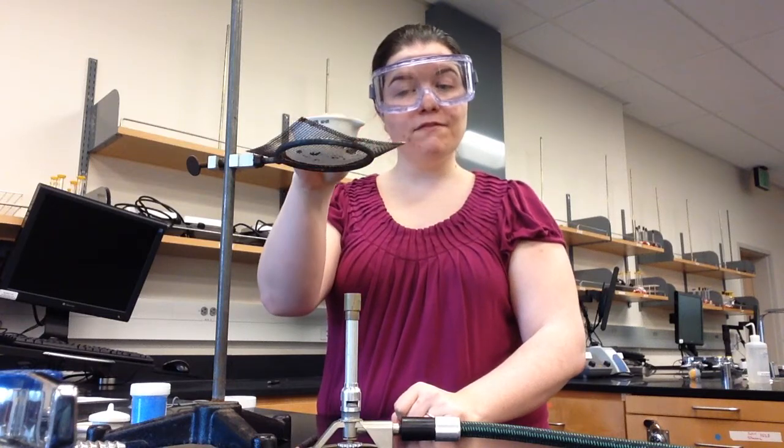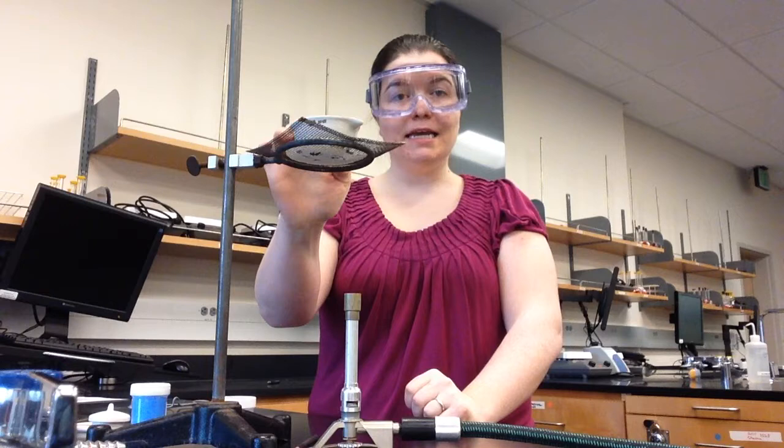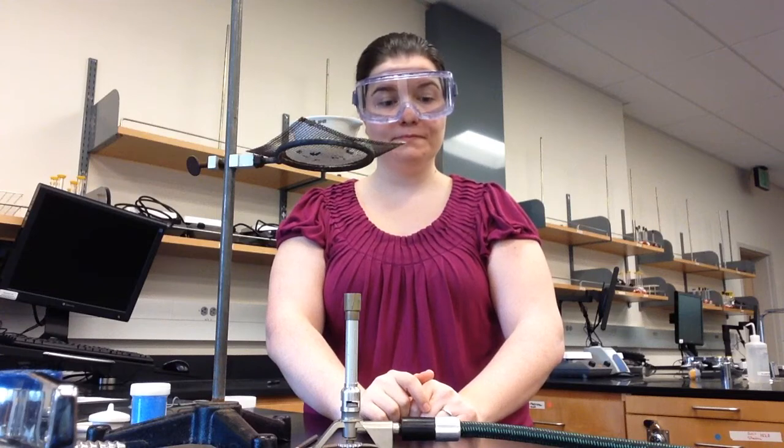You will continue heating for 5 minutes, letting the chemical and the container cool, and measuring the mass until a constant mass has been achieved. Between one mass, a heating, and another mass, there should be a difference of less than 0.01 grams. That means that all of the water has been removed from the chemical.